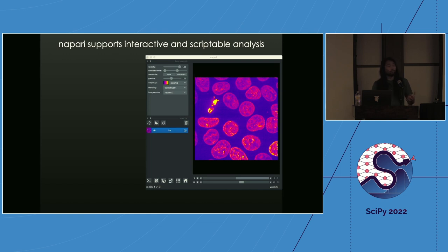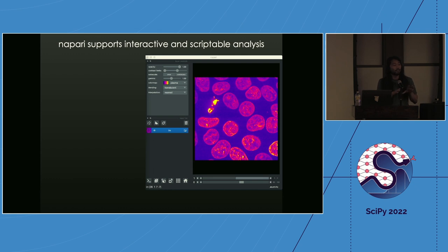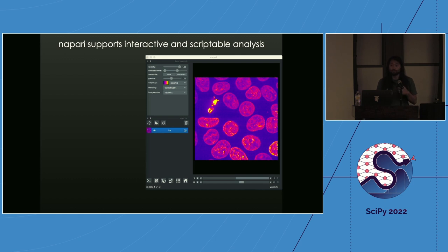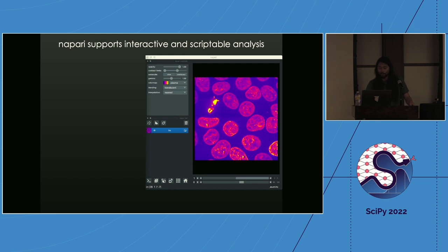Another mode — more of what we'll be doing today — is interactive analysis. This is where you side-by-side use an interactive computing environment like a Jupyter notebook, see the result in the viewer, go back, make a change. I find that's a nice way to gain intuition for how different operations affect the data, and also for human-in-the-loop quality control.